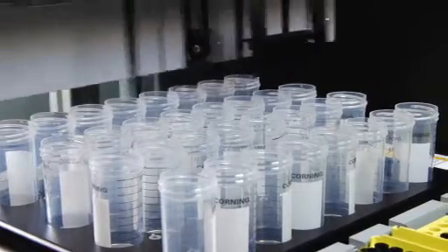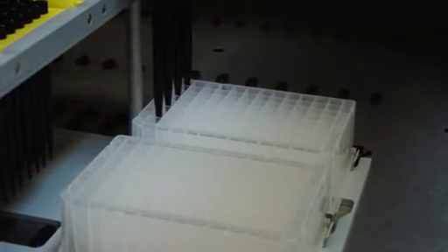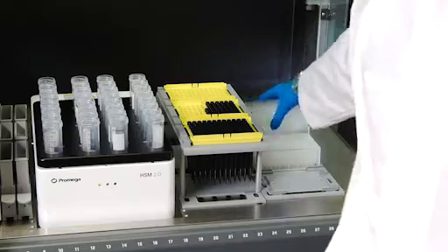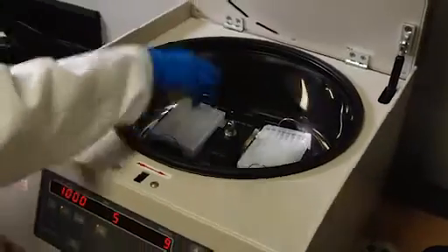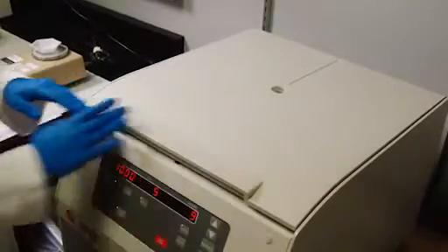After extraction, the eluates are removed from the processing tubes and placed onto an intermediate plate. The intermediate plate is centrifuged off-deck to clear any non-magnetic resin fines and then returned to the liquid handler for transfer to final elution apparatus.